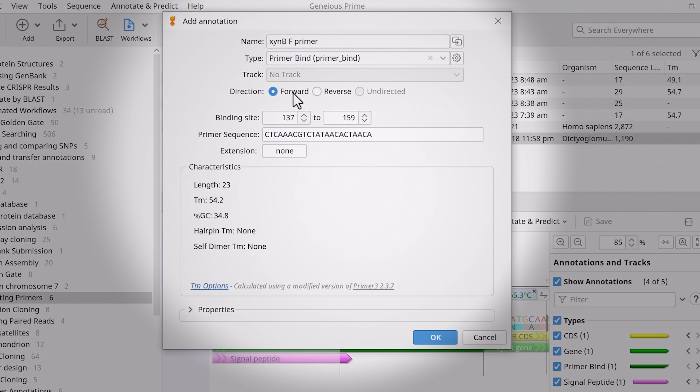give the primer a name and confirm the direction. Below, Genius will indicate the binding site on the sequence and general characteristics of the primer, including the melting temperature and GC content.